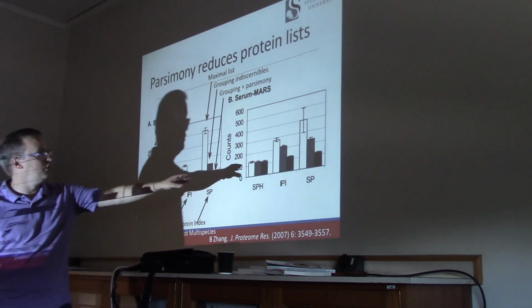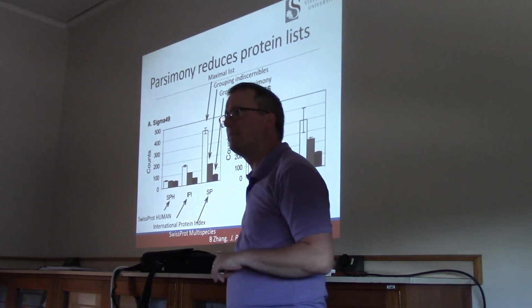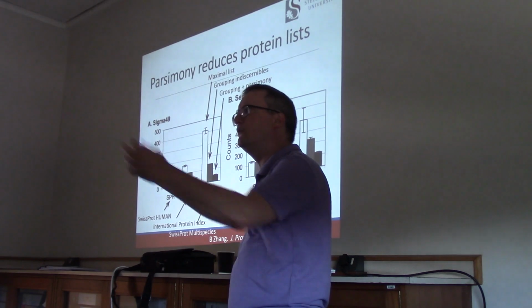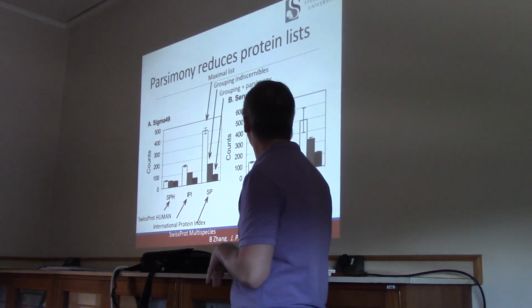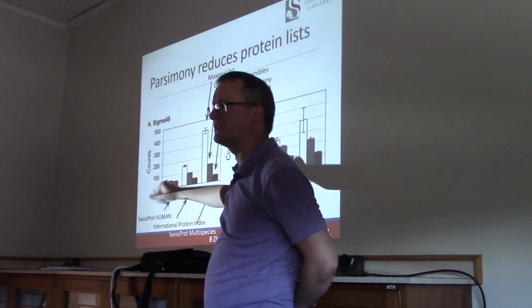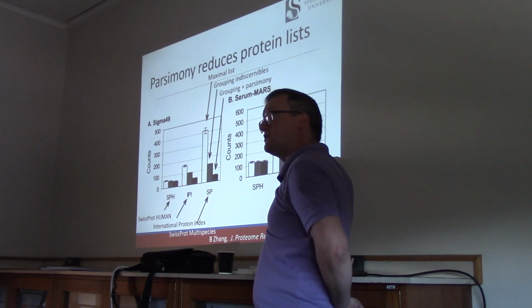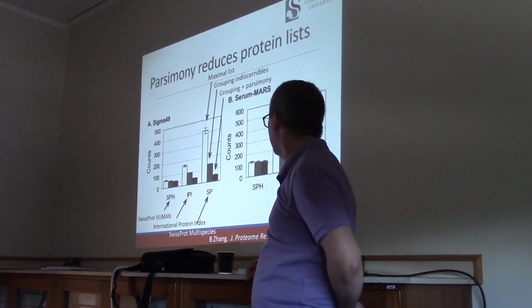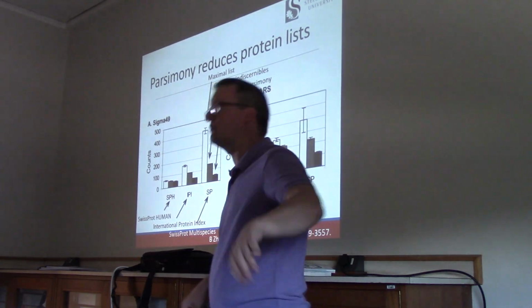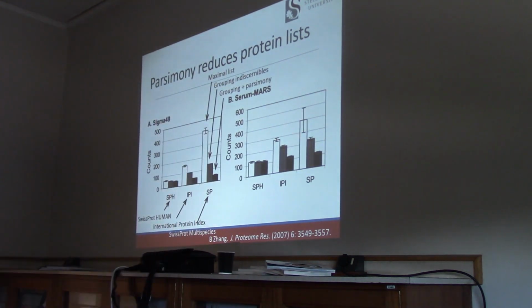The same is true when you work with samples in the real world. So these are serum proteins that have been run over a multiple affinity removal system to remove the most abundant proteins in serum. You can see that the numbers from Swiss-Prot human decline just a little bit because that wasn't a very redundant set. But again, when we look at the multi-species database search result, the number of proteins we claim was far more conservative after grouping together indiscernibles and stripping away the redundant protein IDs.